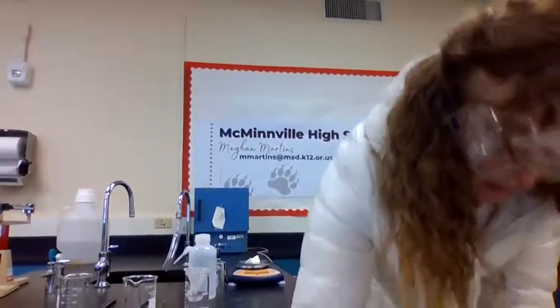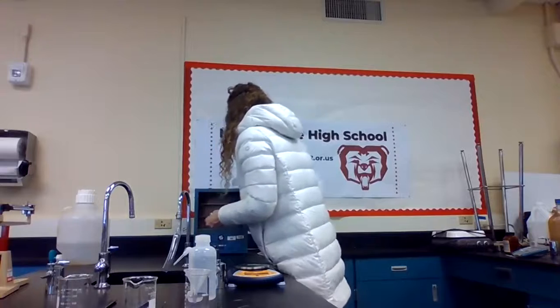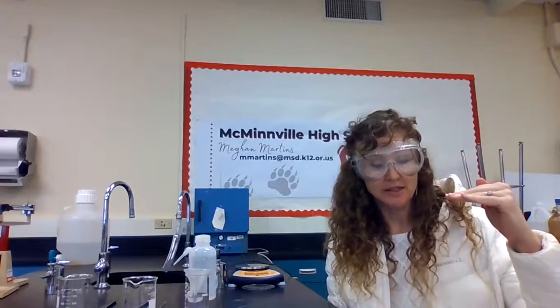Two point three grams. So because our weight keeps changing, we will keep measuring it until it stops losing weight or maybe gains weight again. Then we'll call it completely evaporated, all the water gone, a true measurement of just filter paper and solid.